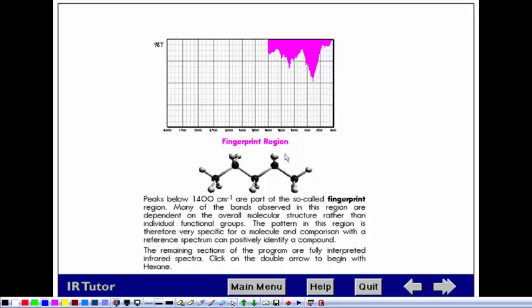And the other place that they use it is in the identification of fibers from clothing. I had to do this for the football field over the summer, because apparently in the spring there was this big concern that football fields were full of lead, and the ones that were full of lead were ones that were made of nylon. They couldn't find the receipt from when they bought the football field, so they didn't know whether it was nylon or polyethylene.